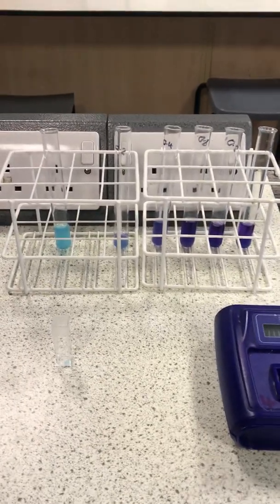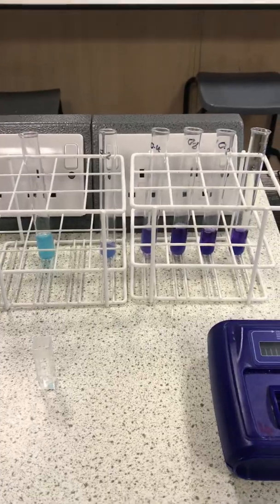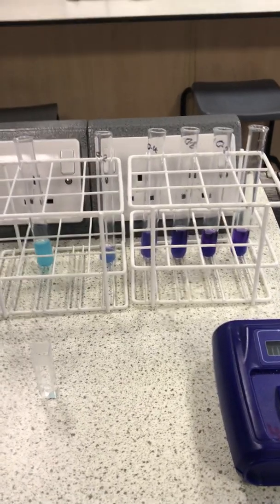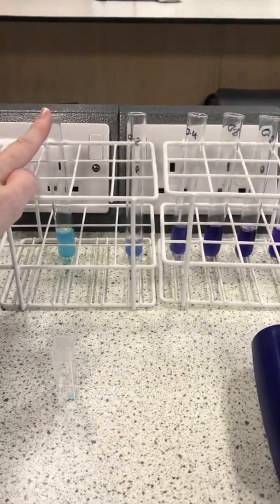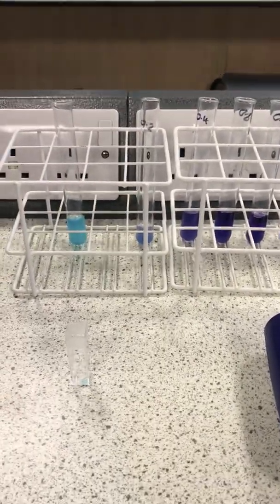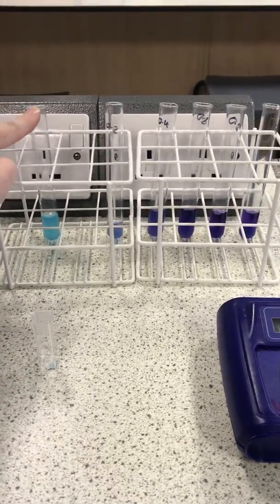So as you can see here then, we've got some different protein concentrations set up, and we've done the Biuret test, so we've got this nice purple colour. And you can see this one here is water. Now the Biuret test reagent gives a blue colour, so that's why this is blue.